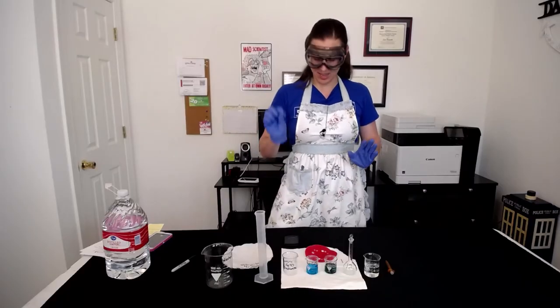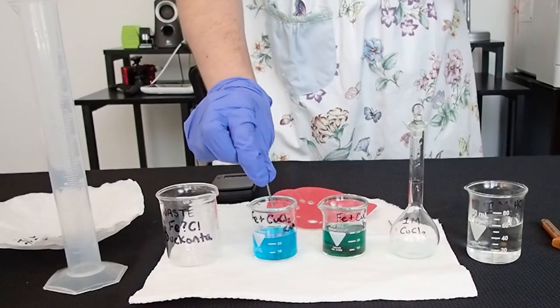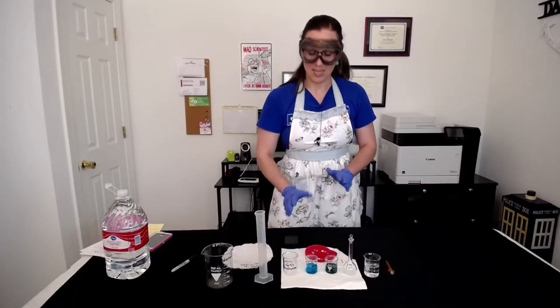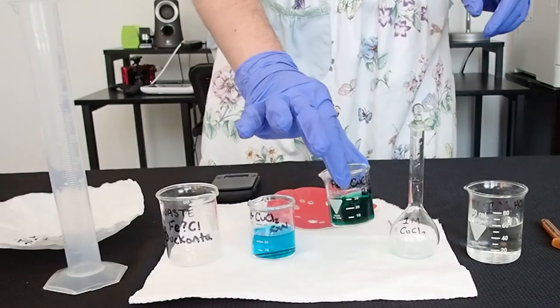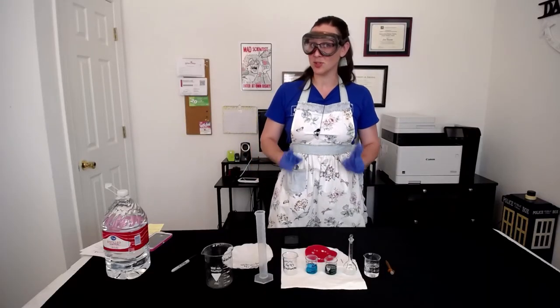Now we can take this nail and drop it in our 25 milliliters of copper chloride solution. We're going to let this nail sit in the solution for 25 minutes. In order to pass the time a little faster, I already did this with a previous experiment and it only has about 4 minutes left to go. Check out the differences in the color of these two solutions.